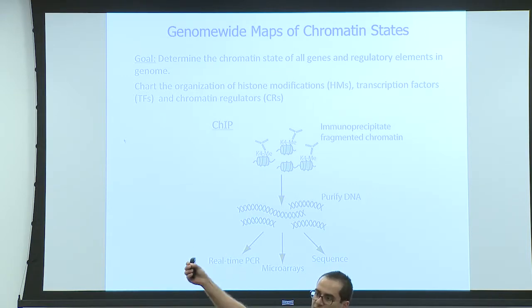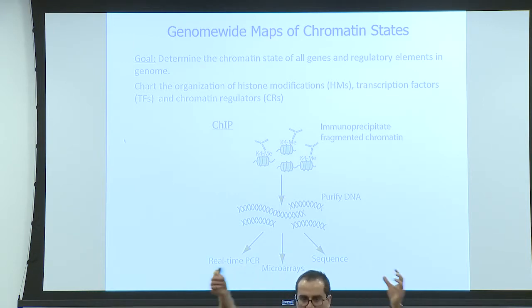But if I take cells, and then I use like 6 or 7 epitopes, like for H3K4me3, H3K27me3, CTCF, and so on, one control, if I started from the same population and I just split it, is enough, because it gives us a good enough reference for all of them.